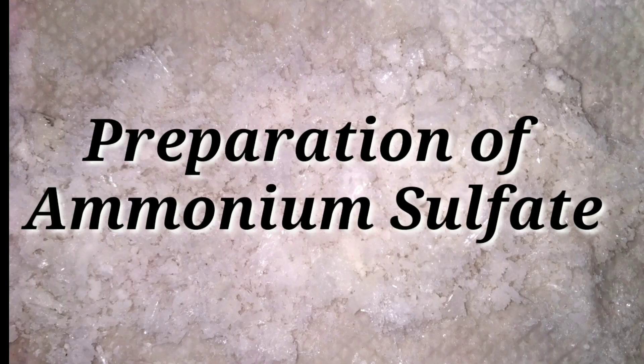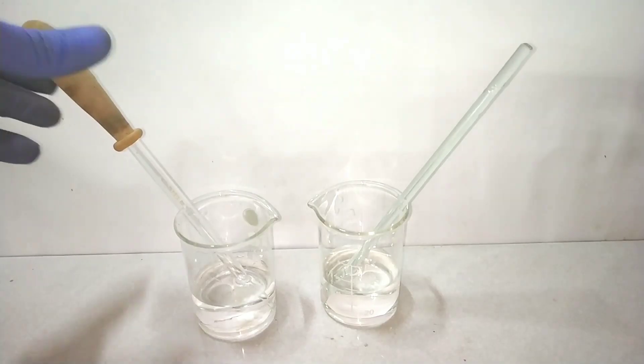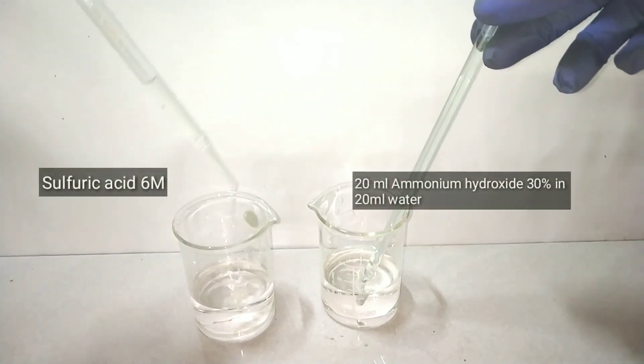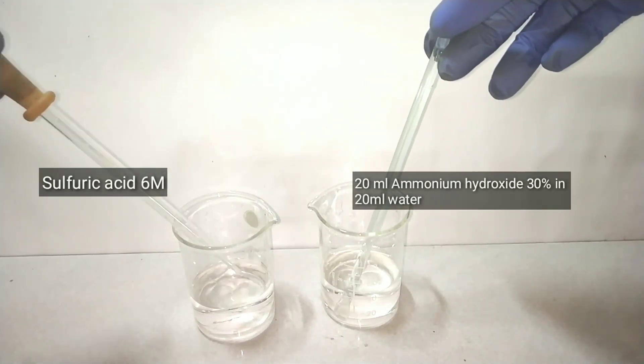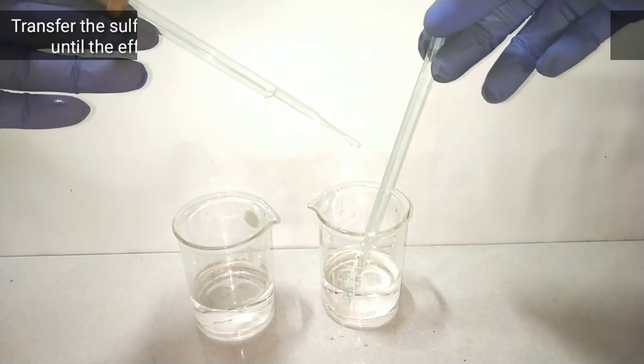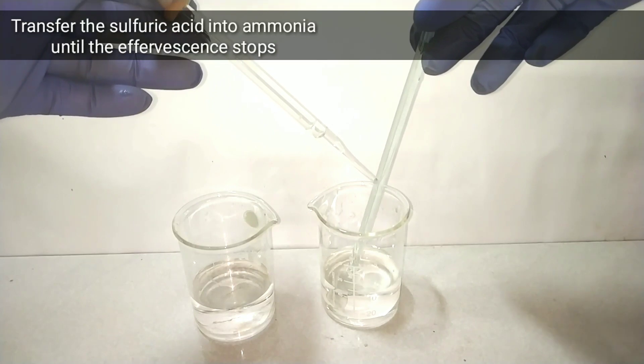Now we will be preparing the ammonium sulfate. This preparation is just a neutralization reaction with ammonium hydroxide and sulfuric acid. I will continue adding the sulfuric acid into the ammonium hydroxide until the bubbles stop forming.